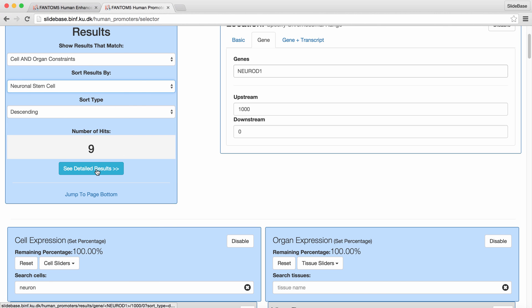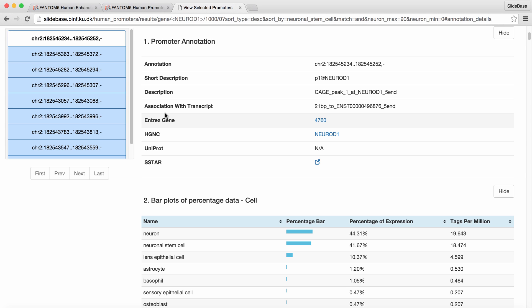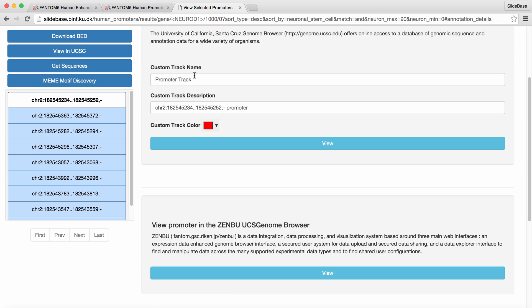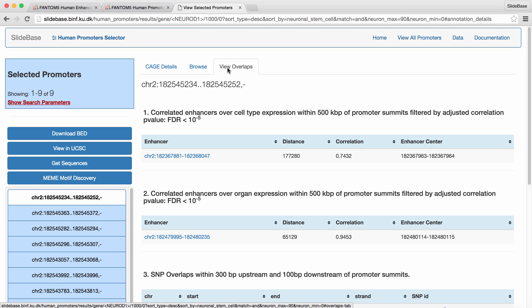We click on the See Detailed Results link to view information about the promoters. Similar to enhancers, we have the promoter list on the left and the tabbed panel on the right, containing individual promoter information and available actions. In the case of promoters, we can also check if they are anonymous or associated with known genes. The promoter P1 at NeuroD1 is associated with the NeuroD1 gene. The promoter expression is related to brain and eye for both tissue and cell samples. Just as with enhancers, we can view the promoter in the UCSC and Zenbu genome browsers, and check if there are any overlapping enhancers and SNPs. For all resulting promoters, we can download as BED files, view in the UCSC genome browser, get promoter sequences, and perform motif discovery using MEME. This concludes our promoter use case example.